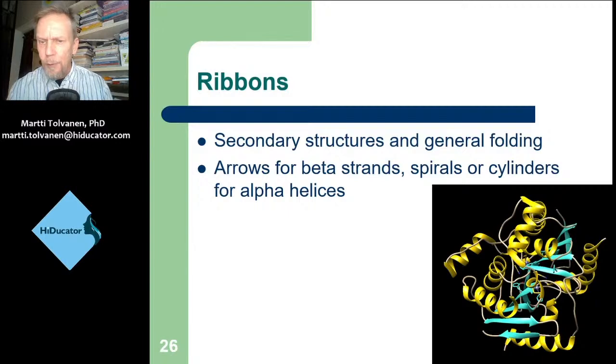And there seems to be a break somewhere, because we have several other ends here as well. Or maybe this is a dimeric protein. Well, anyway, the meaning of this illustration is just to show you secondary structures and the ribbon representation.